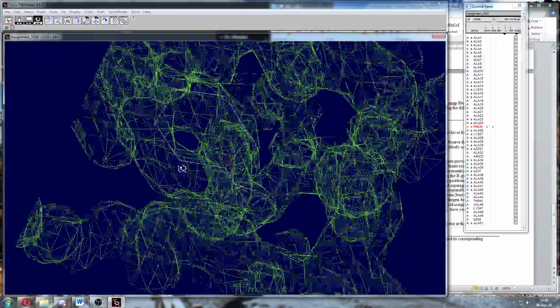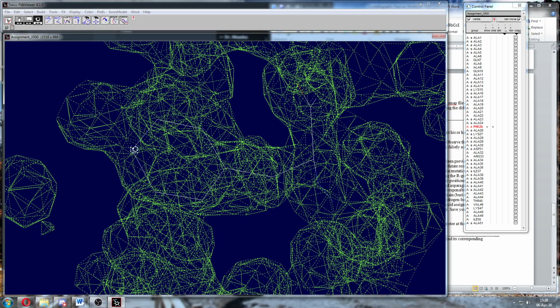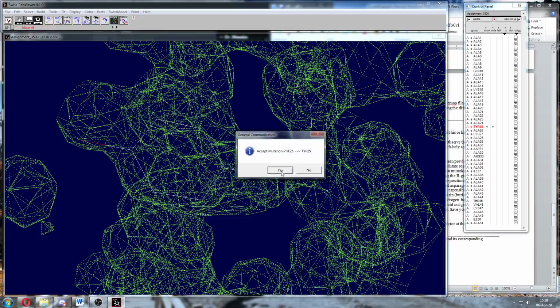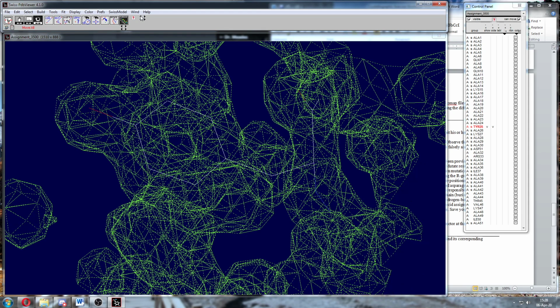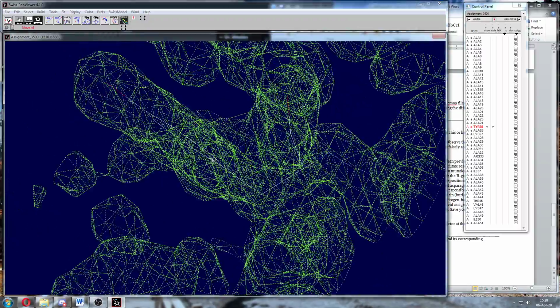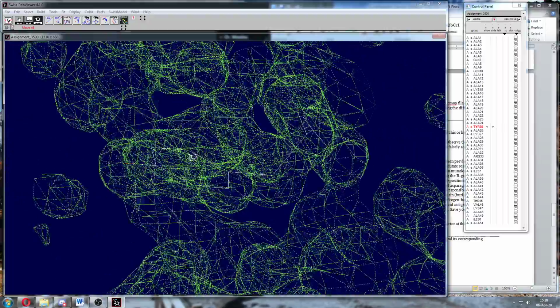Well, in this case, at the end of the ring it looks like there's something else out here. So like before, this isn't phenylalanine, it's most likely a tyrosine. So let's mutate it to tyrosine. Now does it look like it fits? Almost, if I could move this ring over a little. So I'll do that to convince myself. Now does it look like the tyrosine fits? I actually got it pretty well. So I'm convinced this is tyrosine.